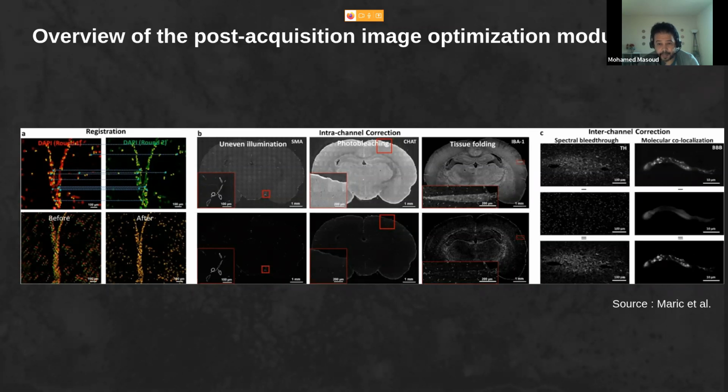And for the inter-channel correction, which is a problem that can happen from mixing the signals of different channels because we are dealing with very thick layers, we can see noise from the neighbor channel affecting the original signal in the current channel.